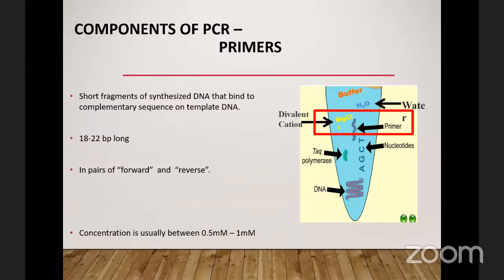Now, we know how the nucleotides pair with one another. So now I have an organism, and let's say the gene I am interested in copying with PCR reads A, G, T, C, G, G, C, G, and so on. The primers will be designed to complementarily bind to those nucleotides, right? So that's the primers that will be designed.